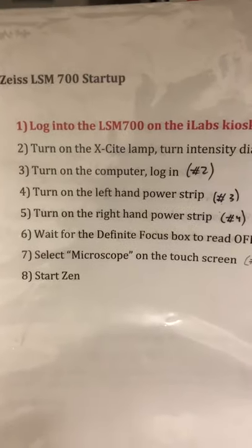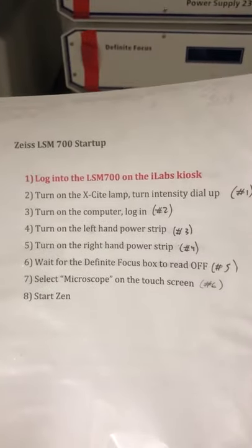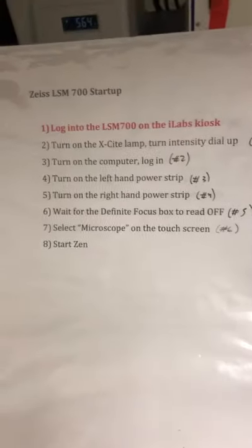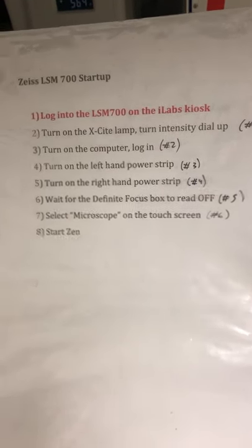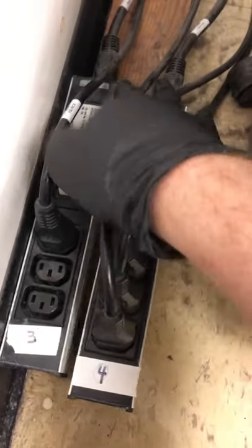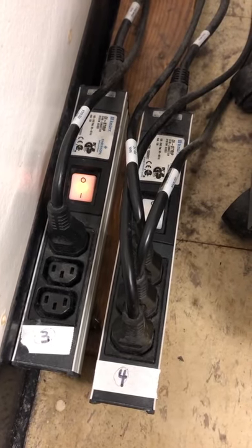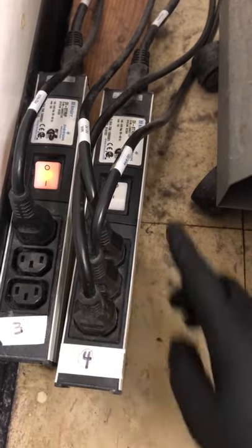We have to turn on the computer and log in. Note that on this system you don't have to log in before doing the next steps. The next step is to turn on the left-hand power strip — that's number three — and then turn on the right-hand power strip. You can hear some noises as things turn on and move.